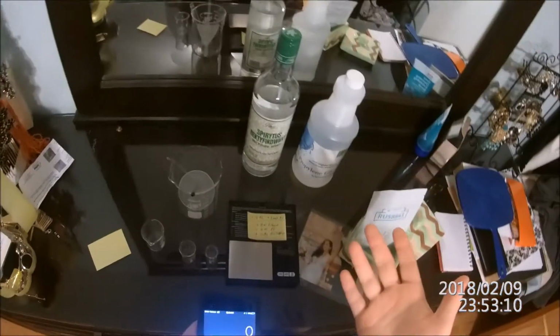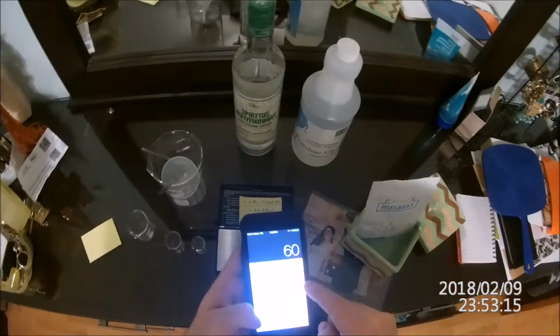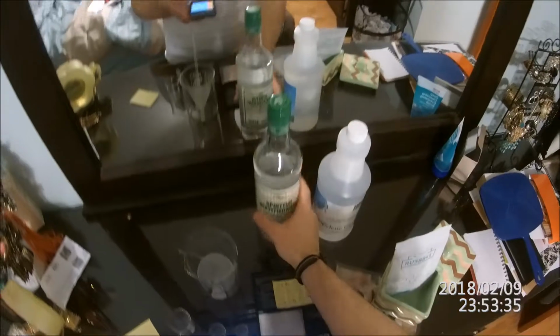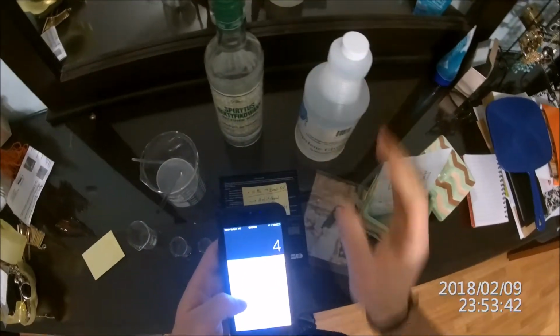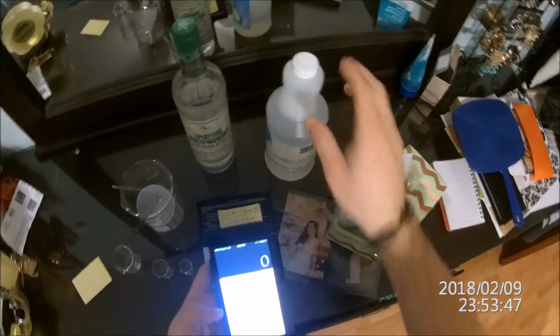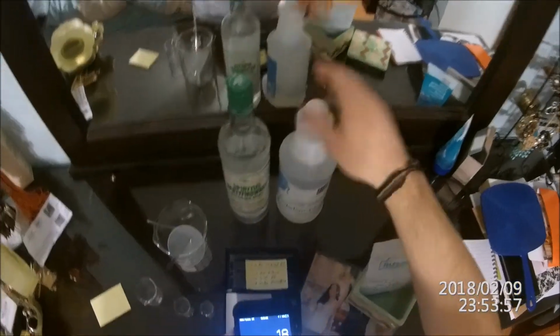If I want to do it for 1 month, that's 60 milliliters. I will say 60 milliliters times 70% of this, 60 times 0.7, I need 42 milliliters of this, and 18 milliliters of this, because 42 plus 18 equals 60, or 60 times 0.3 equals 18. Okay, 18 of this, 42 of this, if I want to make 60 milliliters total.